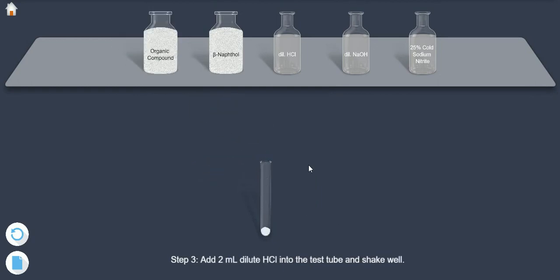Step 3: Add 2 ml dilute HCl into the test tube and shake well.